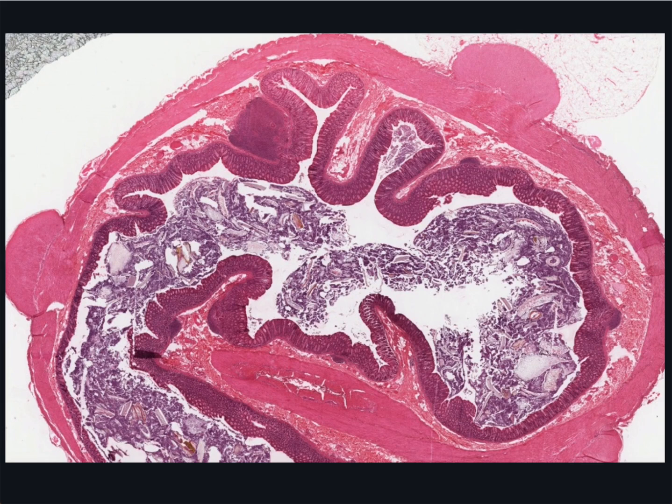The large intestine, or the colon, conforms to the essential features of the gastrointestinal tract. Here's the lumen. So we've got the mucosa, including the muscularis mucosa, the submucosa, muscularis externa, and then the serosa.